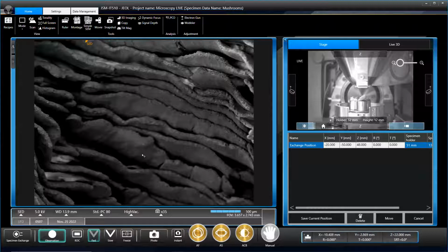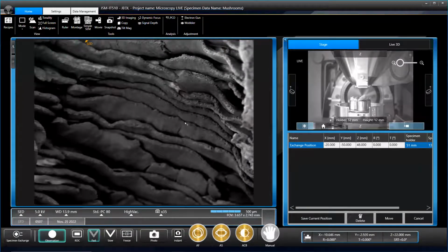You'll have a veil as well, which is underneath, which protects the spores. So when you find a new or young mushroom, it will have these really thin threads that are protecting the spores, and then the cap will open. Then eventually the spores will disperse. And you're left with this little ring, often on the top of the stipe, where the veil broke. And you can often find the colour of the spores as well by looking at the stipe.